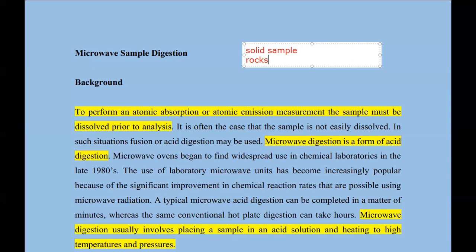The sample is injected into the machine. In a situation whereby you collected solid samples, it is important that you convert them into a usable state. With all that said, that's where this issue comes in. How do we crush the stones?